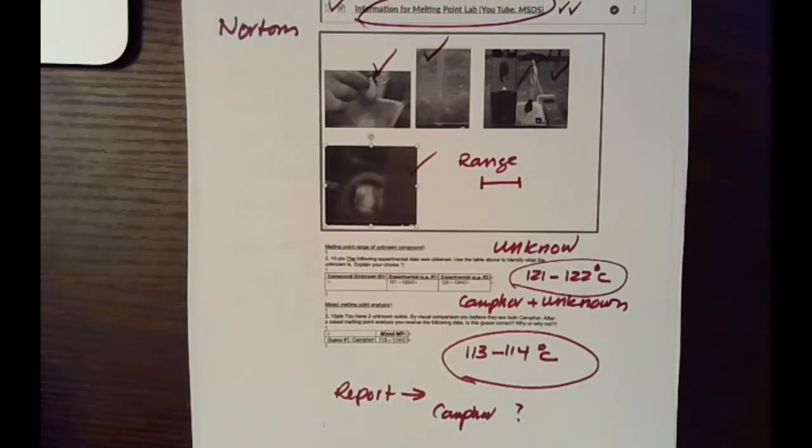So when you're writing or rewriting this report, ask yourself, if the melting point of unknown is 121, 122, you mix it with camphor, melting point dropped. That's not a good one. It dropped. Then you're back looking at your list. Where's my list? Oh, here it is. I'll make a copy of this for you. So if you look at your list, oh my gosh, camphor has 175 to 177. So the nutshell is you guessed it wrong.